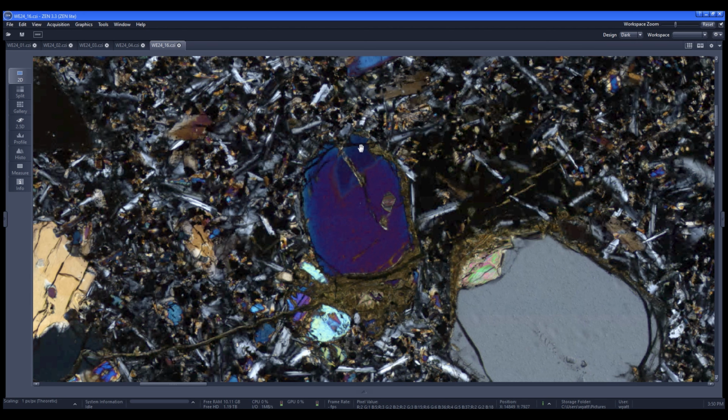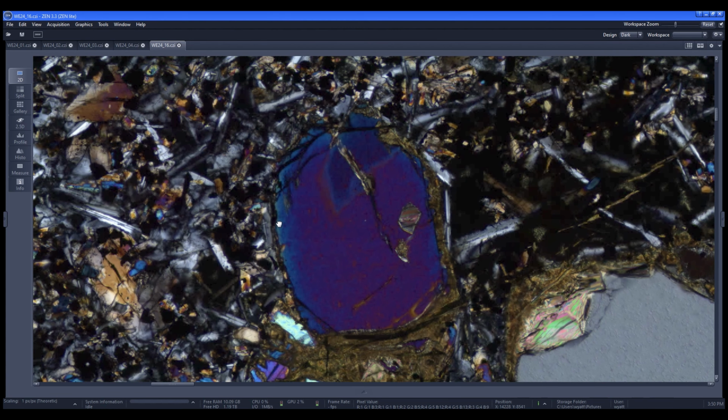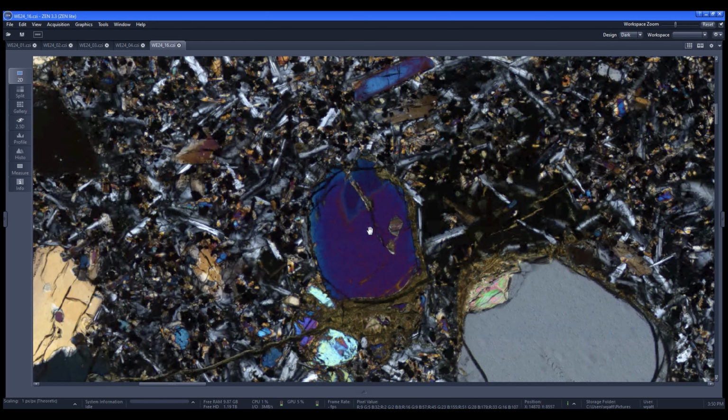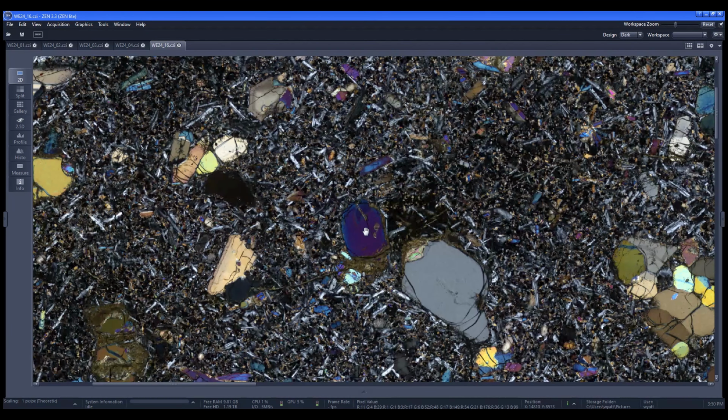So essentially, an olivine that might have started off euhedral might get its edges and crystal faces removed, and it might become rounded as this thing's riding in the magma on its way to the surface. So that's what it looks like might have happened to this olivine.